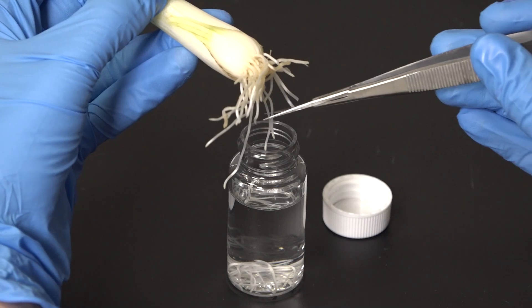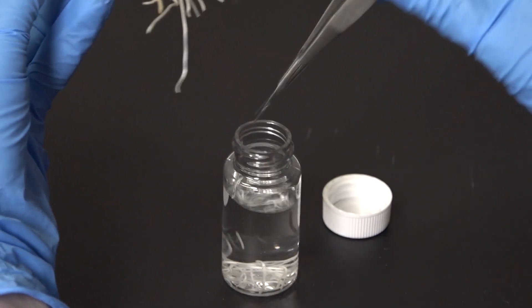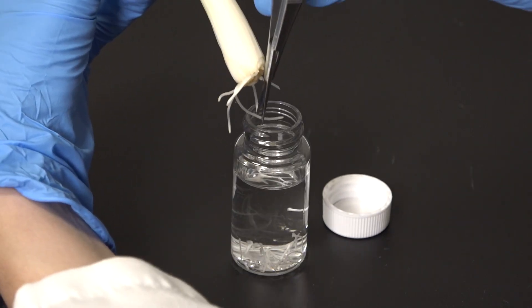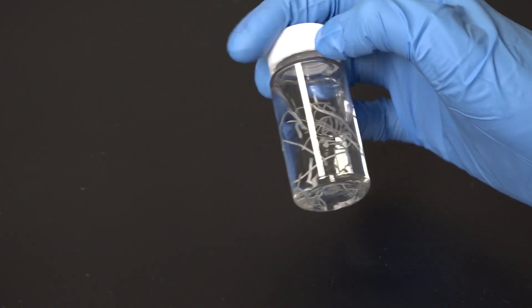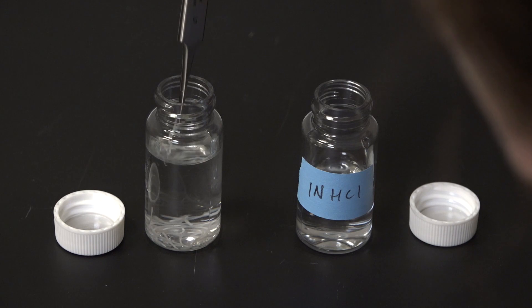I'm using scallions. I've let their roots grow in water for a few days prior to the experiment. First, I'll cut off some root tips into the vial of Farmer's fixative and leave them for at least four hours - overnight is great too. The chemicals will preserve the DNA in the roots. Then I'll transfer them to the vial of hydrochloric acid and let them sit for two minutes to soften the root tissue.